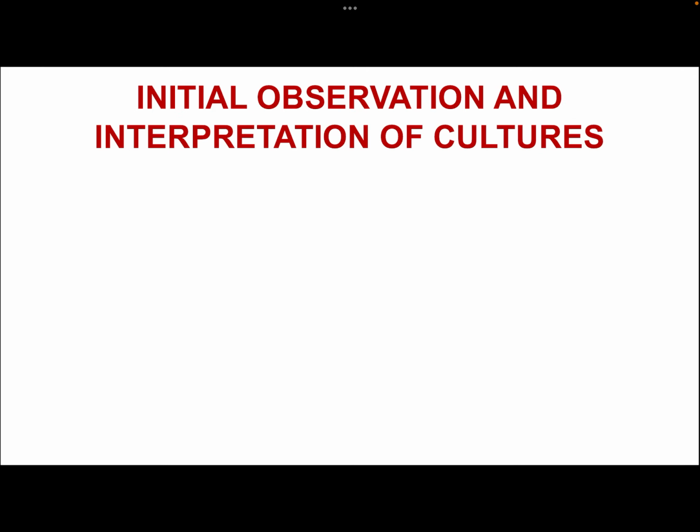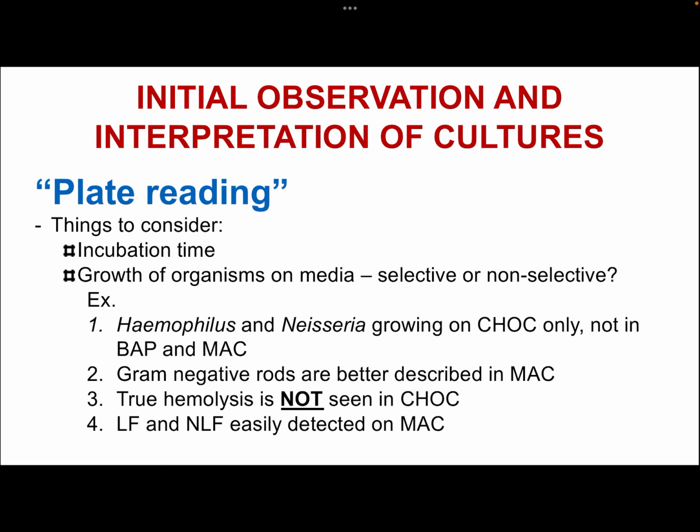Okay, so what we term the initial observation of the culture is plate reading. Also, you have to consider the incubation time. As I have said, bacteria tend to grow in 18 to 24 hours, so you can observe colonies already on a Petri dish containing that solidified agar. Why is it that incubation time is important? Because some of the bacteria will change their morphology as you continue incubating the culture.